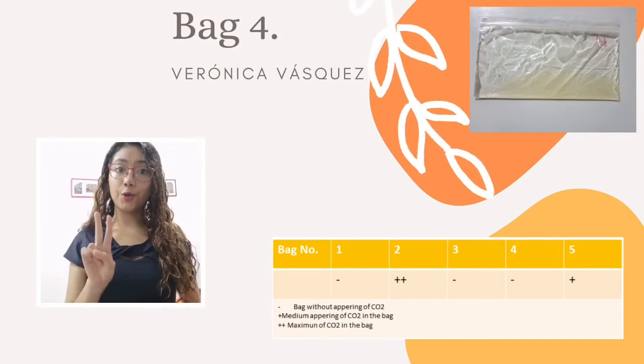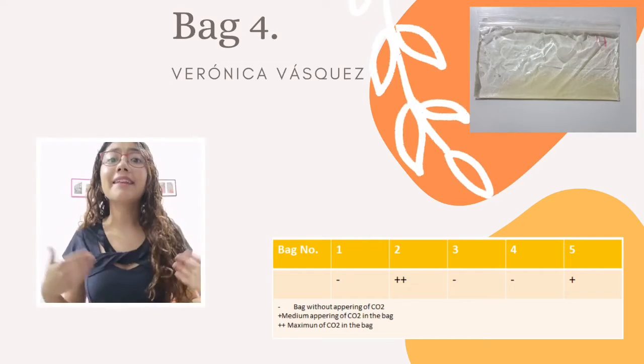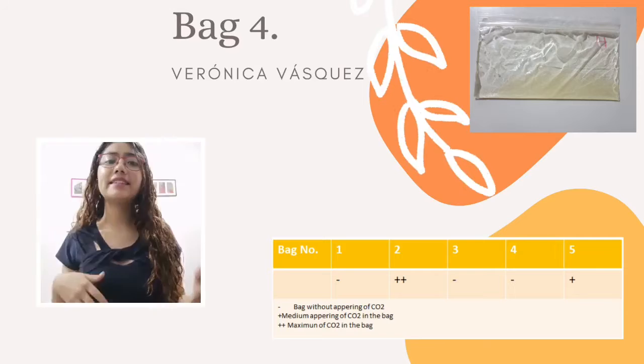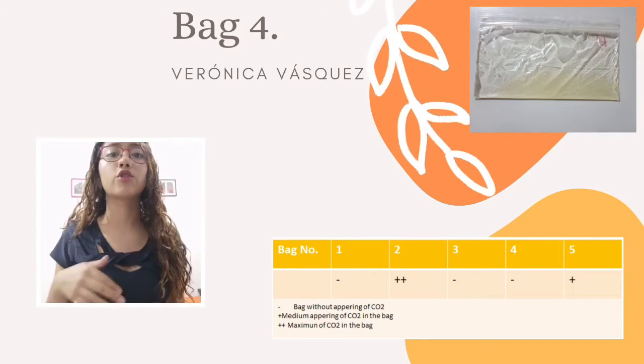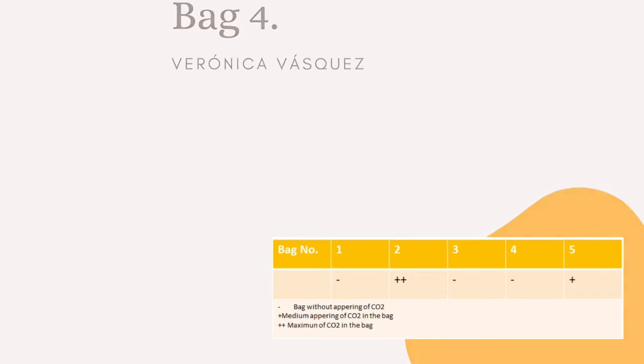Control number 2 is system 4. In it, all the members obtained a negative result because it doesn't contain yeast, which provides the zymase responsible for catalyzing glucose and other simple sugars into ethyl alcohol and carbon dioxide.